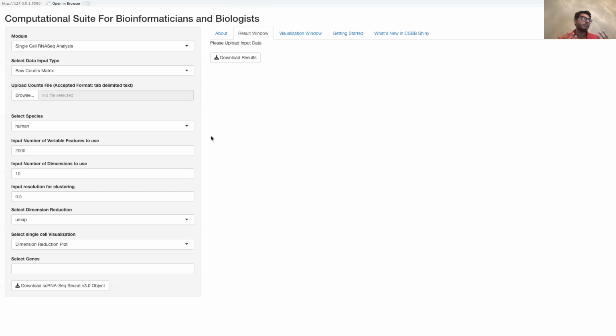The main reason for creating this module is to give more feasible options to people who don't want to code or use the R command line or console versions. They can just come to this interactive web page where they can input their data, play with the parameters, and generate different plots and analyses, and use that for their research or grants or whatever purposes they're using it for.